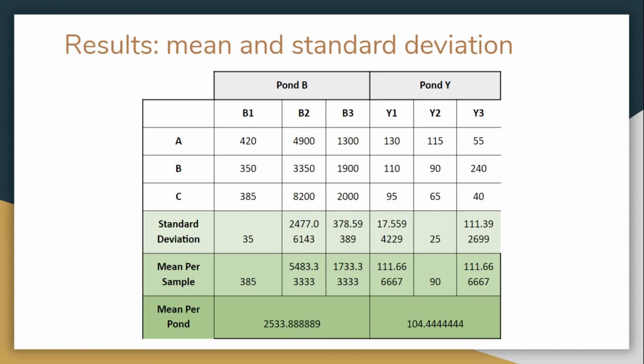Overall, the Bigner Pond showed greater concentrations in colonies on average as compared to the Yuck Pond. Bigner Pond might have conditions that are more suitable for bacterial growth than the Yuck Pond. Although some of the samples from the Yuck Pond had actinomyces present spreaders, the antibiotic properties may have prevented bacterial growth, lowering the total CFUs per pond Y. Plates Y2, 1xB, and Y3, 1xC showed the presence of spreaders.